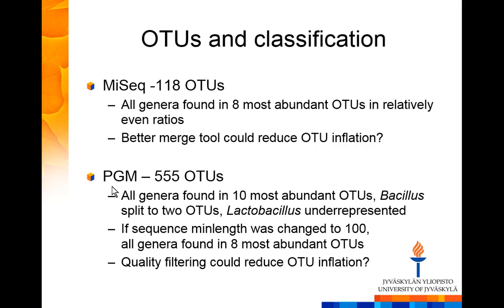For OTUs, from which I already filtered out the singleton OTUs, so OTUs that had just one sequence in that operational taxonomic unit. By the way, do you know what is an OTU, or operational taxonomic unit? Who wouldn't be comfortable explaining it at 4 o'clock at night? Many of you. So OTU is operational taxonomic unit.